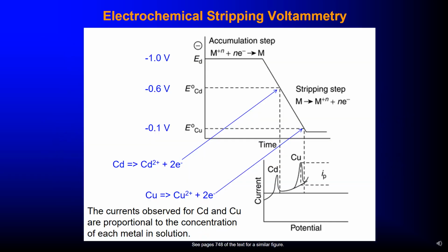So molecular analysis, detection of the insecticide methylparathion using stripping square wave voltammetry with an electrode made from tetrasulfonated phthalocyanine deposited on a carbon surface with a sodium ion sulfonated tetrafluoroethylene copolymer coating.